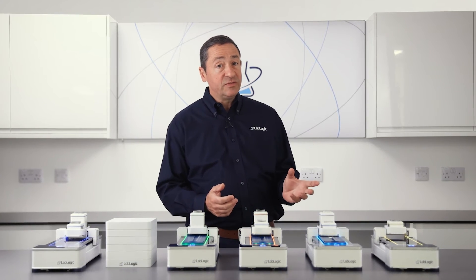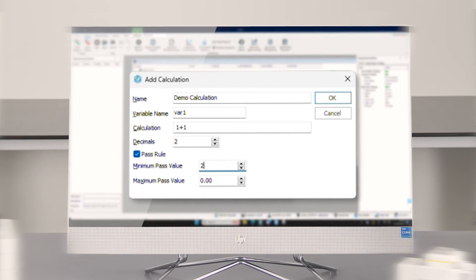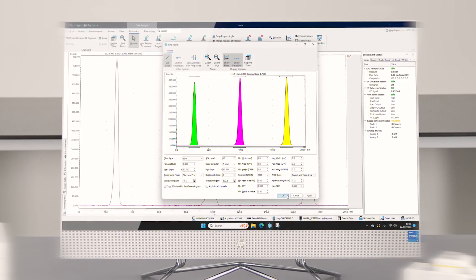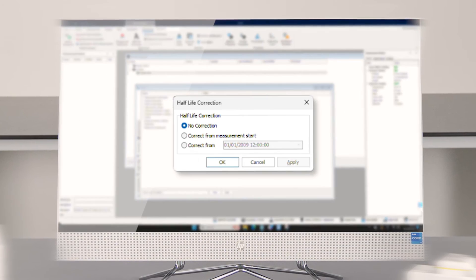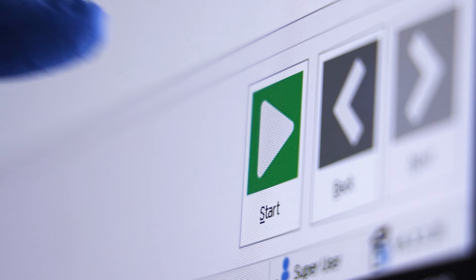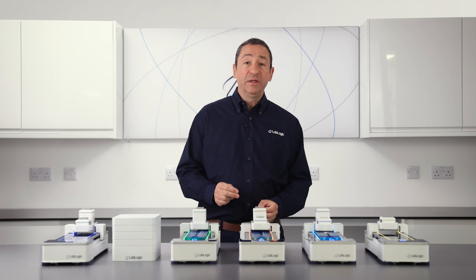Laura also has many useful and unique features such as configurable pass and fail criteria, automatic peak finder, and half-life correction. The new QuickStart wizard has an intuitive user interface that simply requires only two clicks to complete your run.